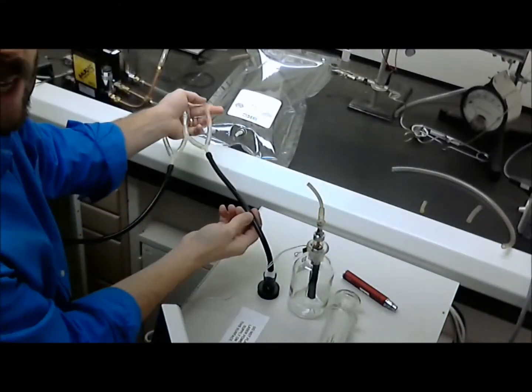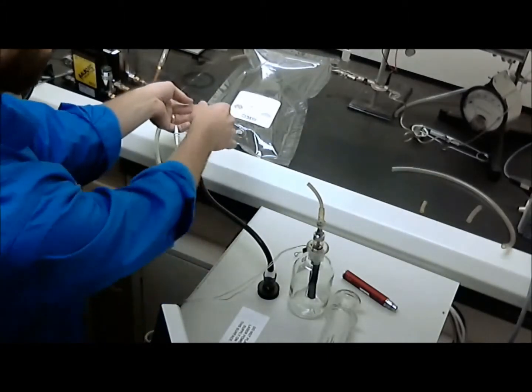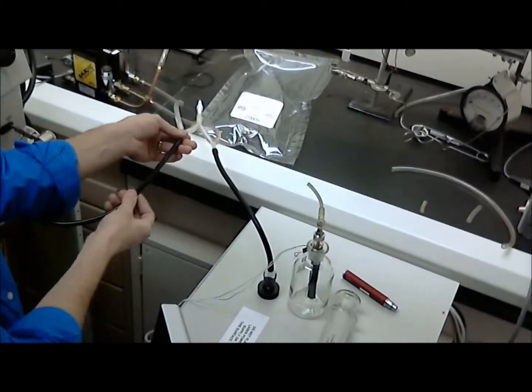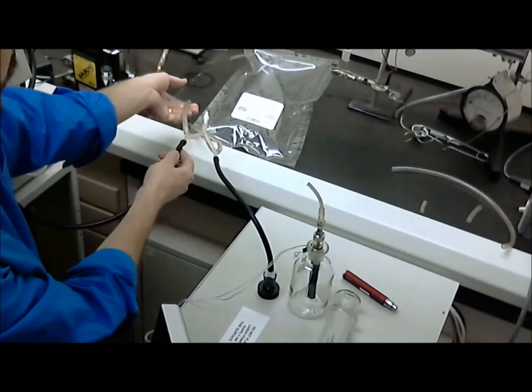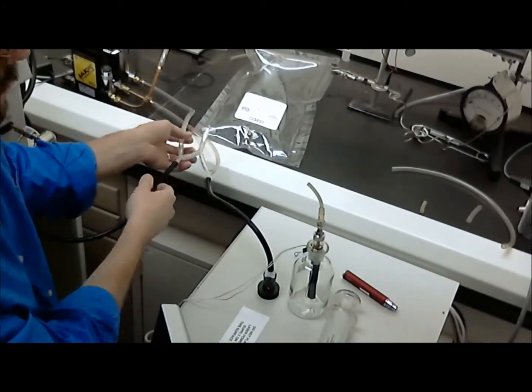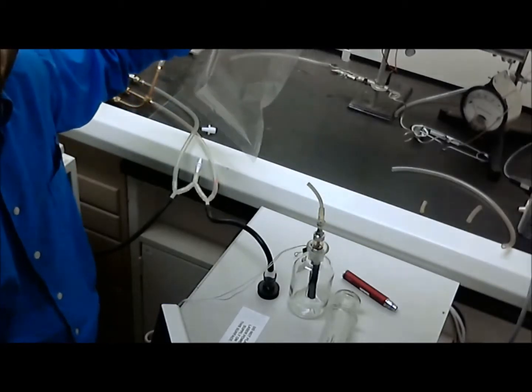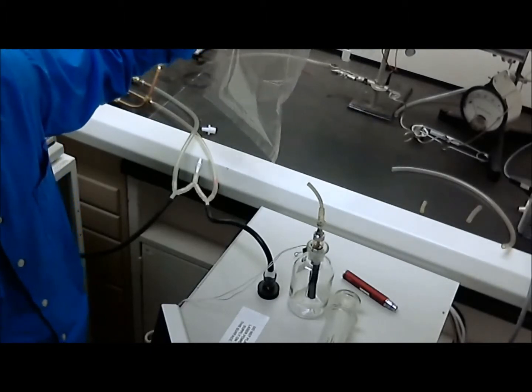The total flow to the APS is around 4.7 liters per minute. The dilution flow was around 4.5 liters per minute. The total flow to the SMPS was around 1.5 liters a minute, and the dilution flow was around 1.3 liters a minute. When the syringe injection was made into the bag, the total dilution at this point was around 270-fold.